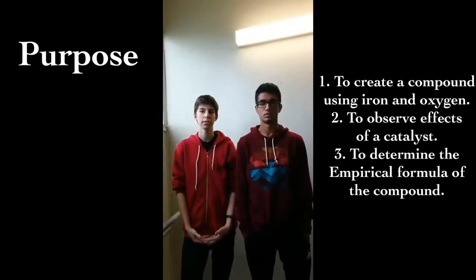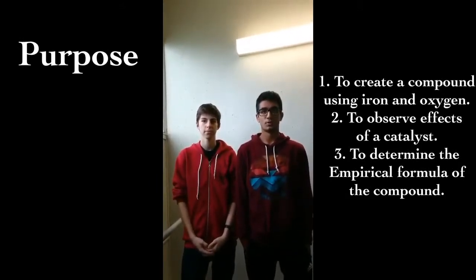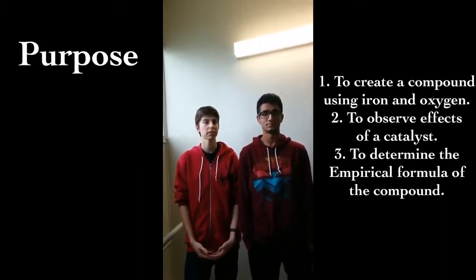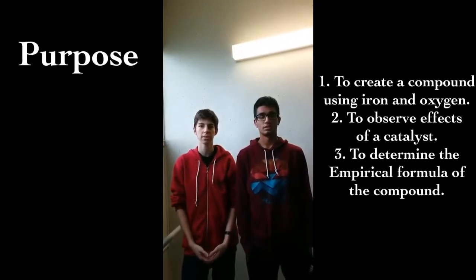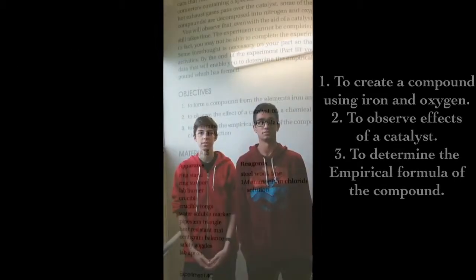Lab 4C, determining the empirical formula of a compound. The purpose of this lab is to form a compound from the elements iron and oxygen, to observe the effect of a catalyst on a chemical reaction, and to determine the empirical formula of the compound produced in the chemical reaction.